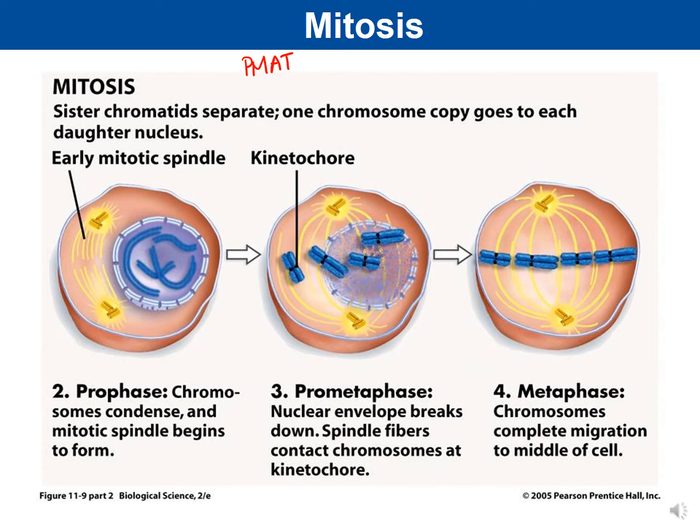You'll notice that sometimes people will separate out prometaphase as its own phase. For the purpose of lab today, all the events that you see in prometaphase, go ahead and lump into prophase. So we're going to condense that and just call that all part of prophase. Some people will call it early prophase and late prophase. Some will actually call it a separate prometaphase. But for the purpose of this, we're going to put prophase and prometaphase in the same category.